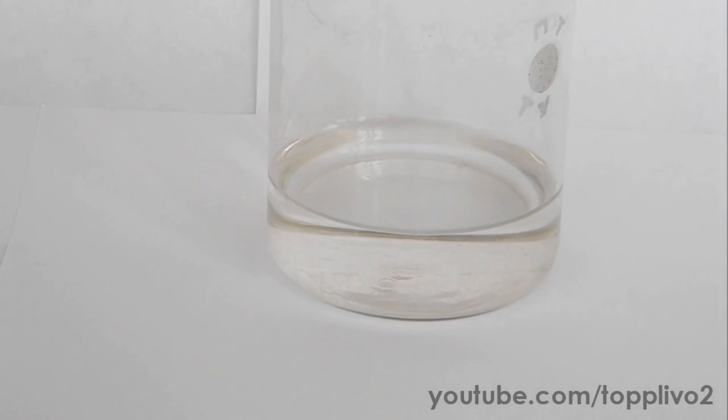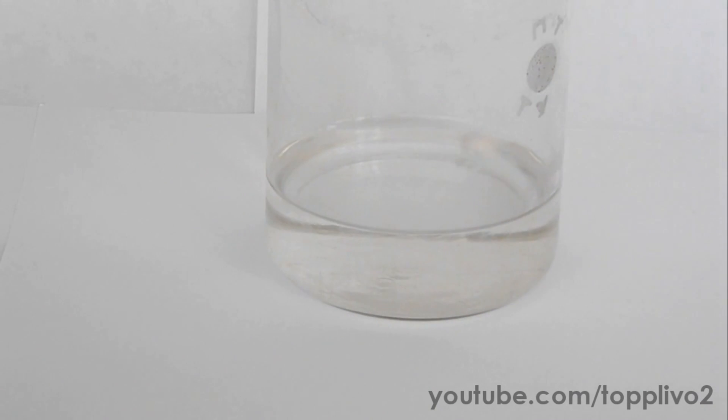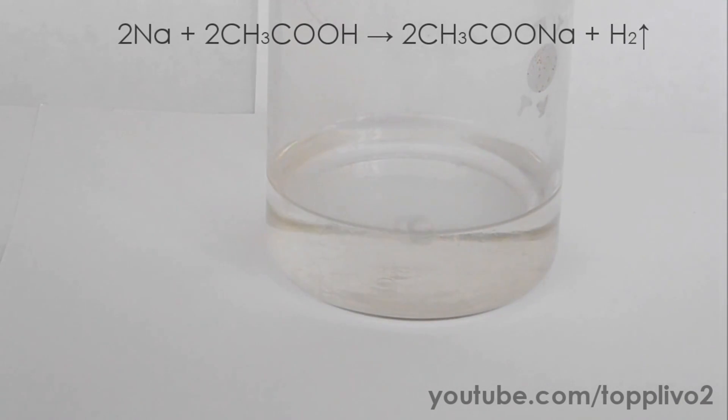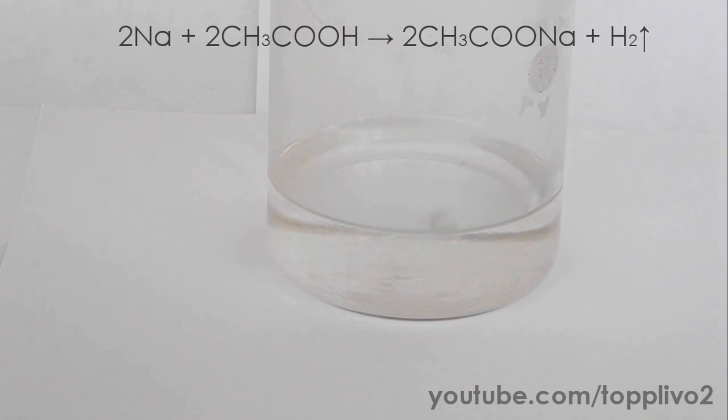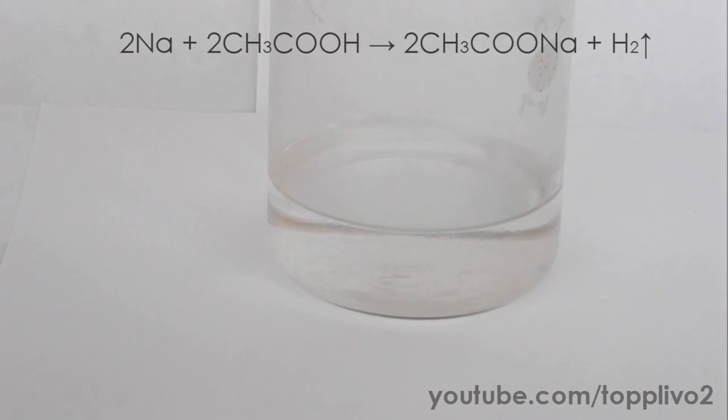Next, let's view the reaction of sodium with 30% acetic acid. Sodium lights up first, and then the reaction proceeds the same way as it does with water.